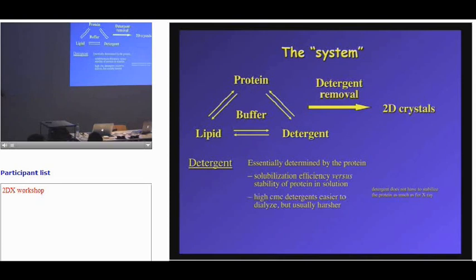I think the reason that we don't get there is that we think we can get 2D crystals from a crappy purification, and the crappy is more or less happy, and so at least it makes some crystals that are okay for negative stain. But if you want a 3-angstrom crystal, well, some groups can do that. But in most cases, including my own lab, I think this is one of the reasons why we don't get to very high resolution crystals, because we think we don't need X-ray quality.